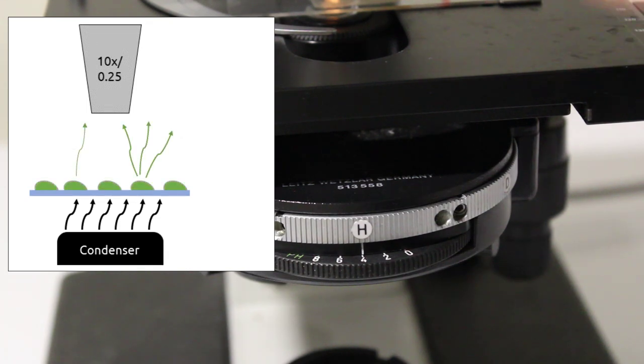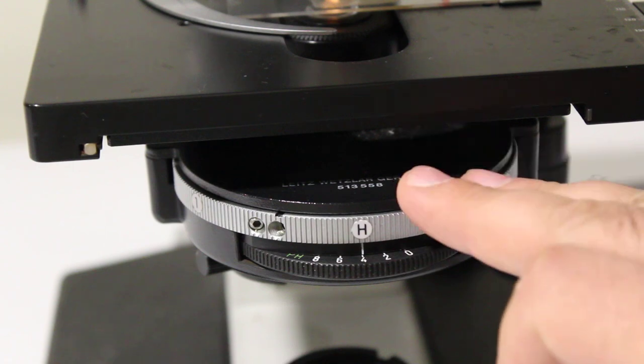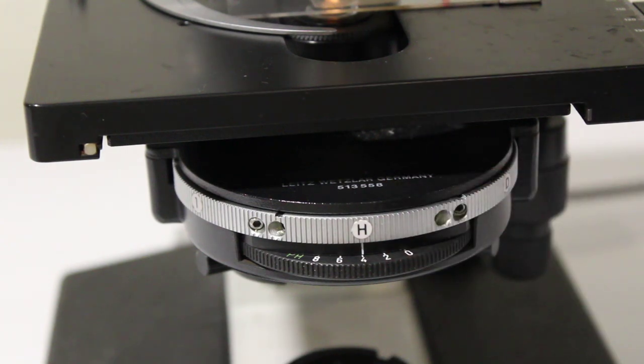Now one is to use chemical dyes to stain the yeast which we'll go into in episode 9 but there are other techniques and those are what are enabled by this particular condenser. So my condenser actually has two additional imaging modes.